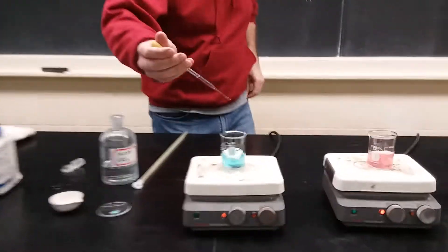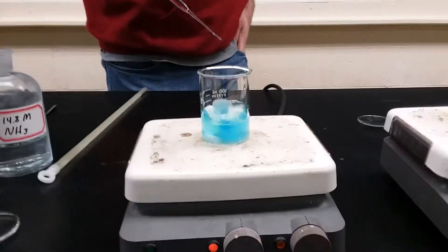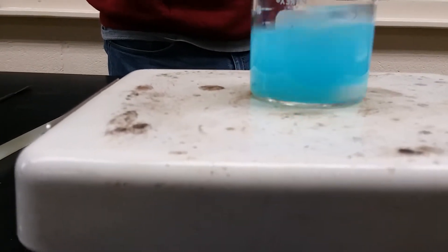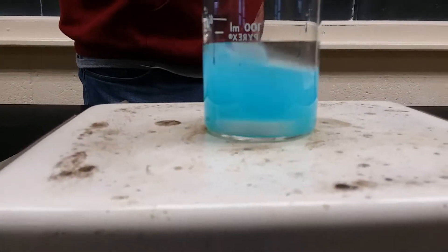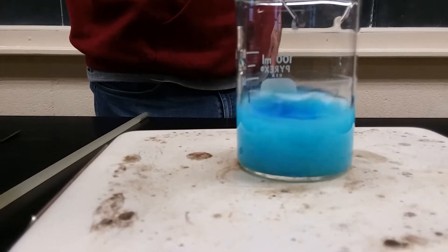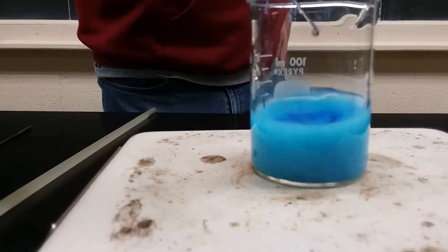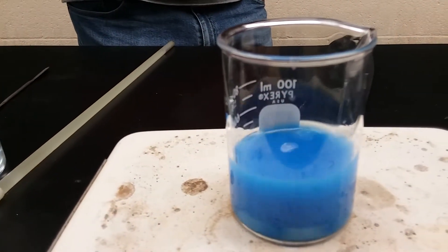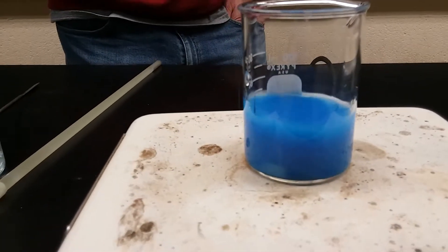So if you look at this carefully, it turns really dark blue. But then it goes back. But if I keep adding a perfect stoichiometric amount, which is of course exactly what I'm doing, we get a different color.